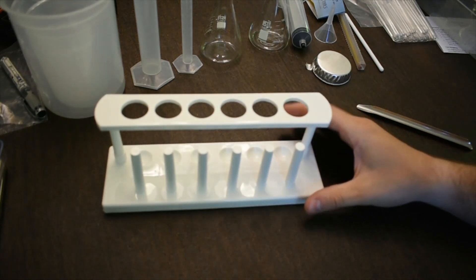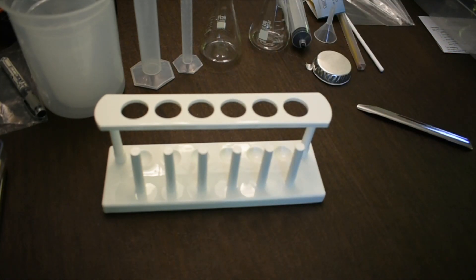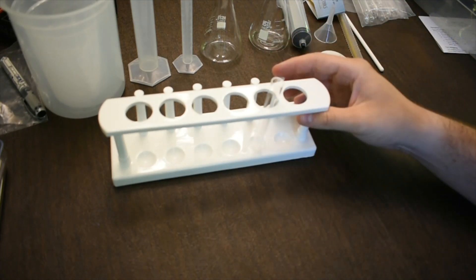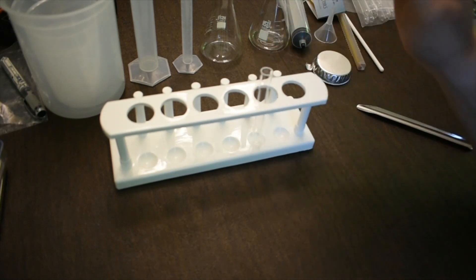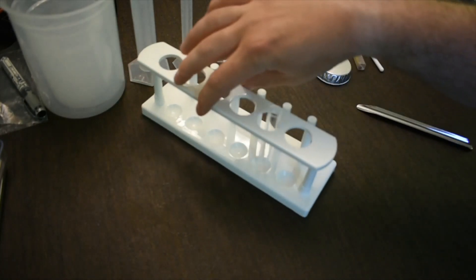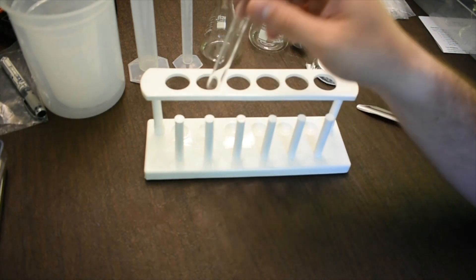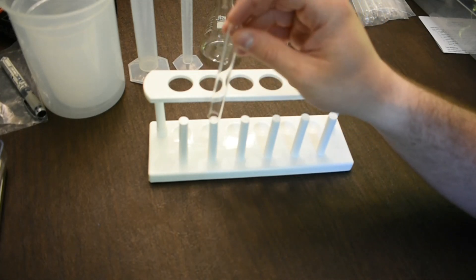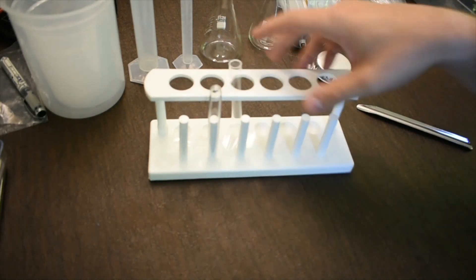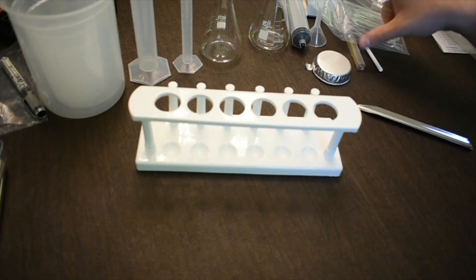The test tube rack holds the test tubes so you can observe reactions without physically holding the tube. You can add a solid and a liquid and watch the reaction. When you're done, you can rinse test tubes and stand them vertically to drain. You can also keep backup test tubes in the rack in case you need a fresh one for the next reaction.